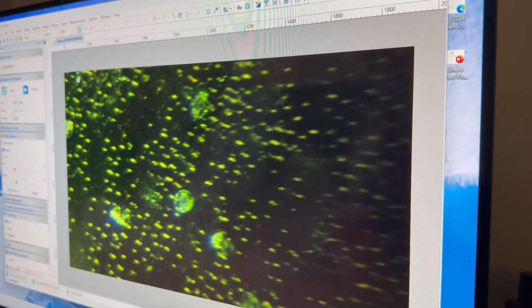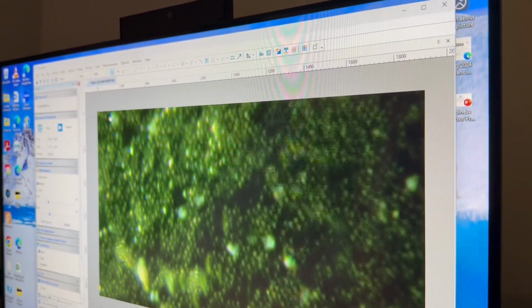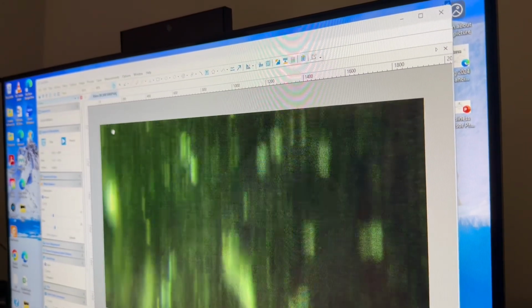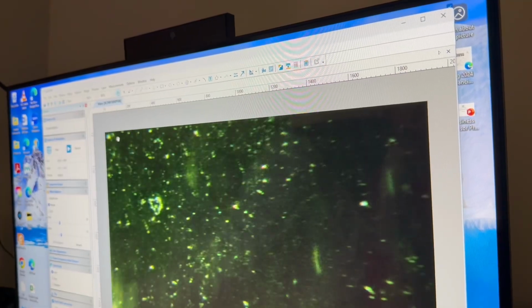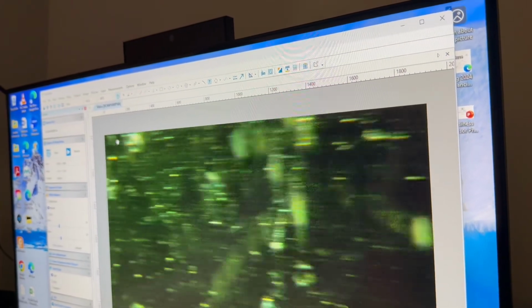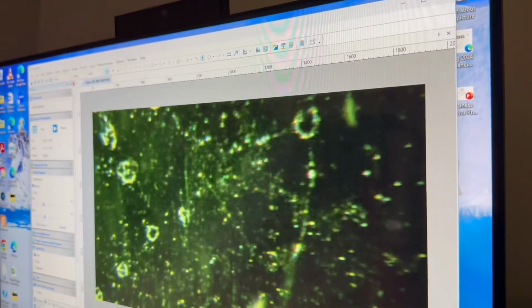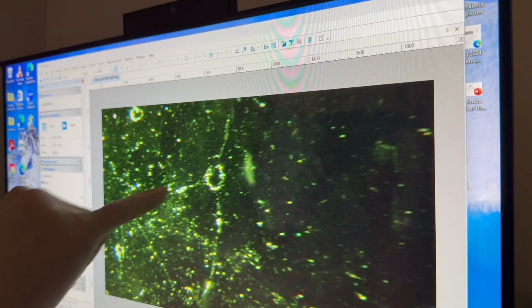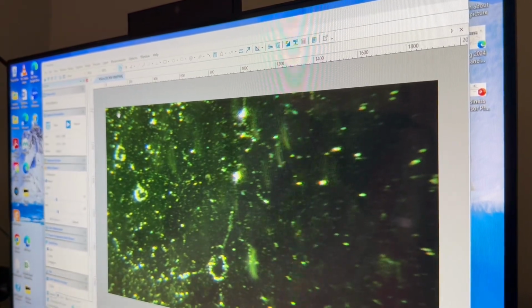So I'm going to go back out. She's really good on threads. There's very few, if any. It's really good. So here we go again. Yeah, it's one of those line things. And it actually goes from white blood cells. You've got your white blood cells. Looks like a neutrophil cell, like it's trying to.